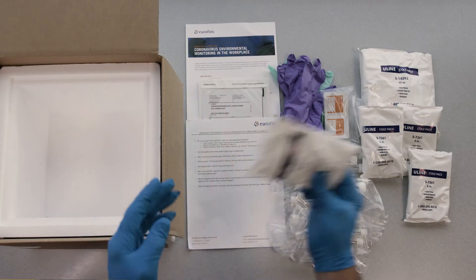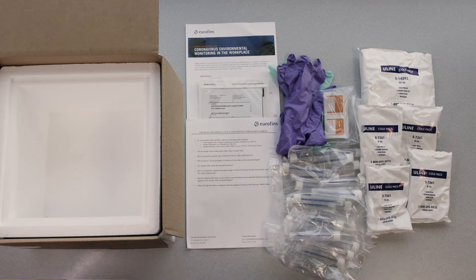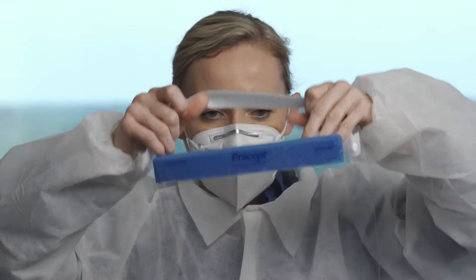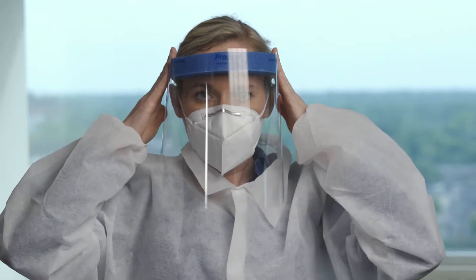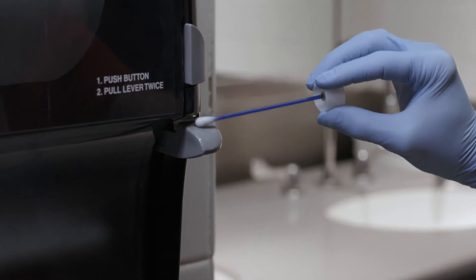You need to apply these principles when sampling your environment to ensure your safety and the effectiveness of your environmental monitoring program. Where available, it is recommended that you utilize all of the CDC recommended PPE for aseptic sample collection.